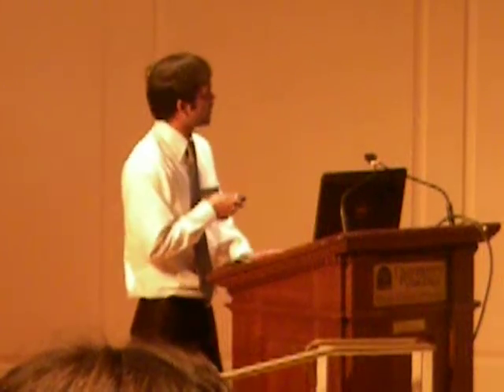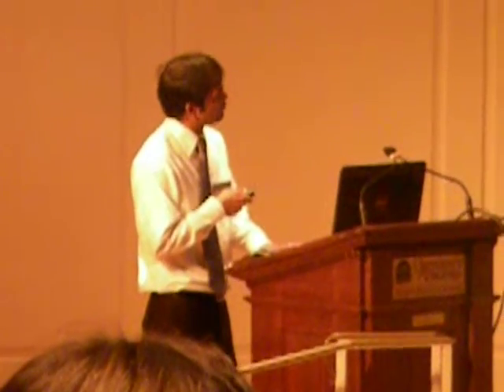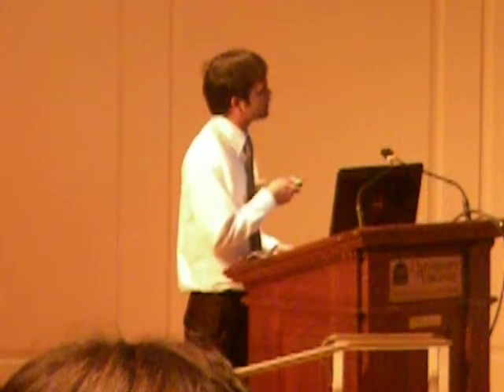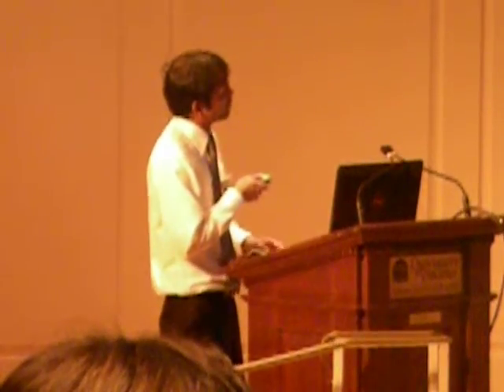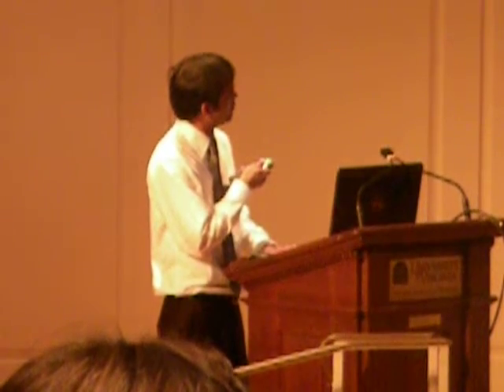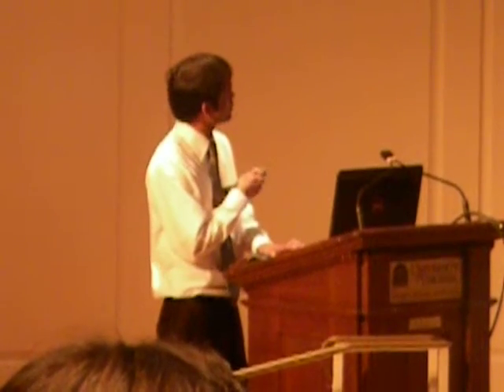When I reverse calculated the scattering profile and compared it with the experimental profile, I saw that the chi value, the fit of the experimental with the model, is quite good. Keeping in mind that we are still missing a few hundred residues, we are still getting a fit with a chi square value of around 2.7, which is much better, and the characteristic depression and bumps are quite characteristic here also.